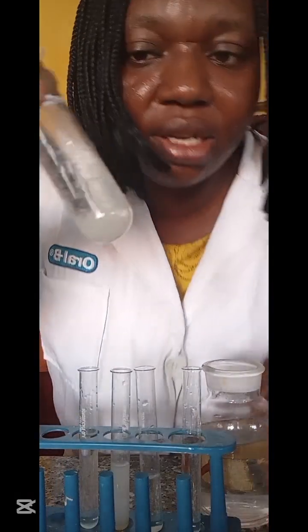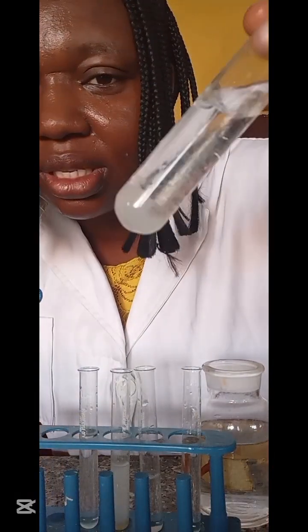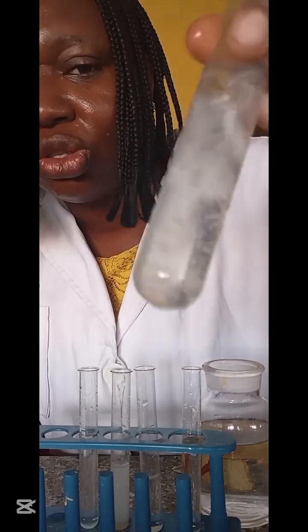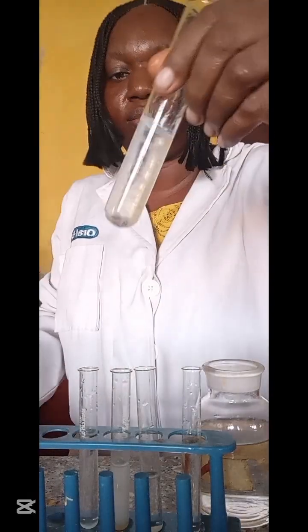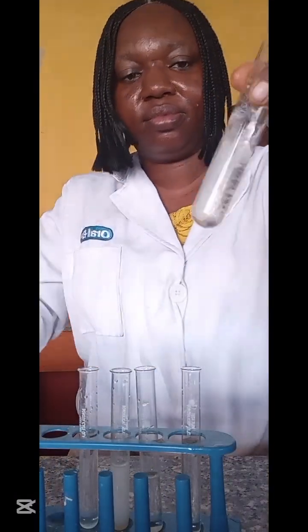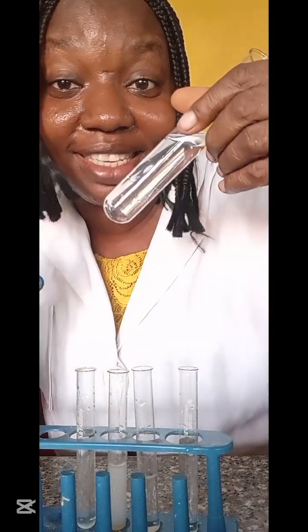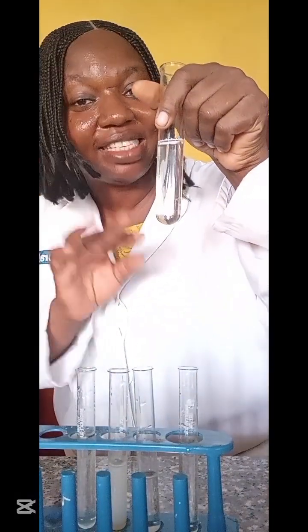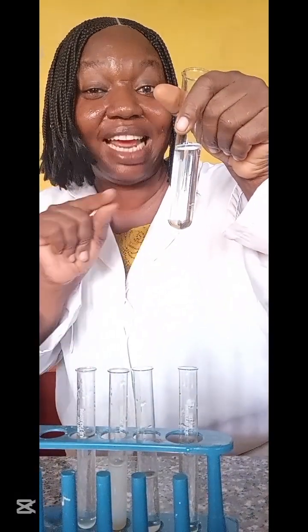Then excess ammonia. You see it's clearing up. There's a reason why they said excess. You begin to shake it. So, as you can see, it has dissolved. So that is telling us that this is zinc. It is soluble in excess sodium hydroxide, also soluble in excess ammonia.